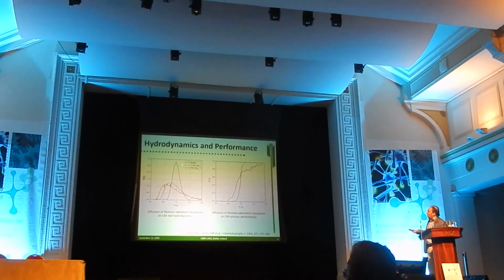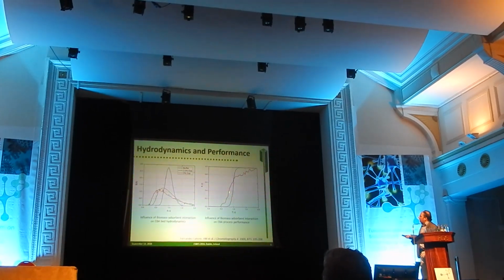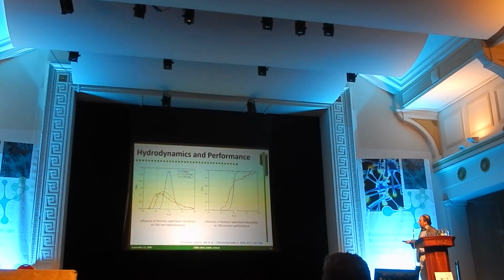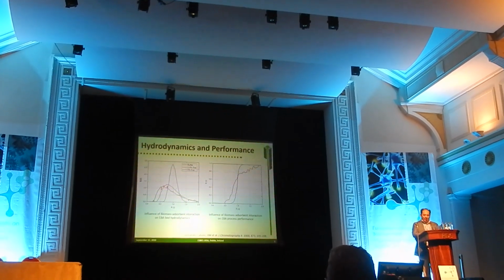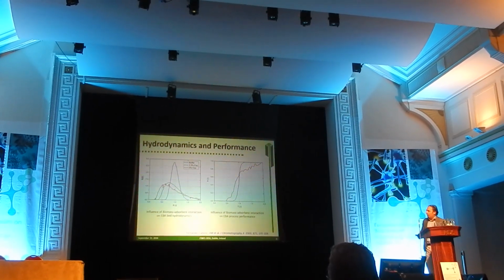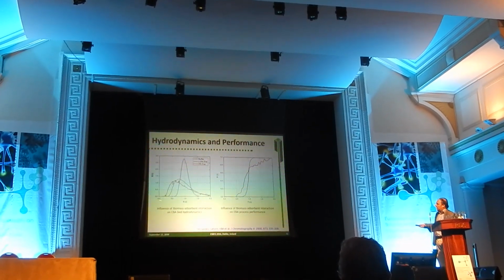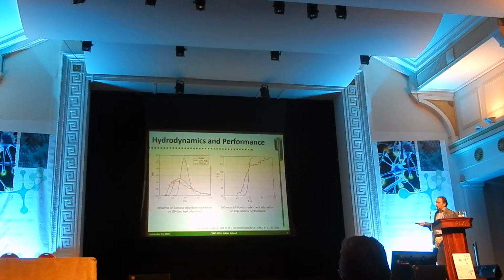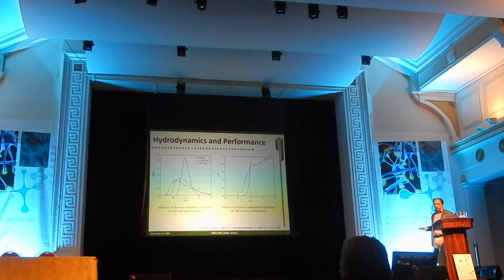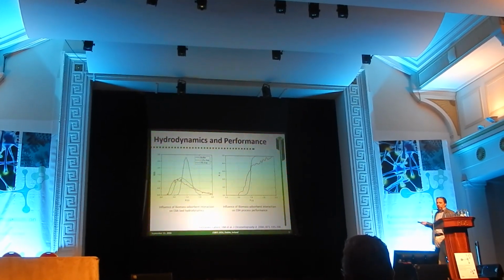And okay, a well-behaved residence time distribution, preserved hydrodynamics, correlates with very sharp breakthrough here, so we can actually use a lot of the available capacity in the adsorbent. On the other side, distorted hydrodynamics, the tracer here, you see how it is coming very fast because there are channels, but also there are dead zones here, so part of the tracer is being retained or is spending more time, so to say, within the system.